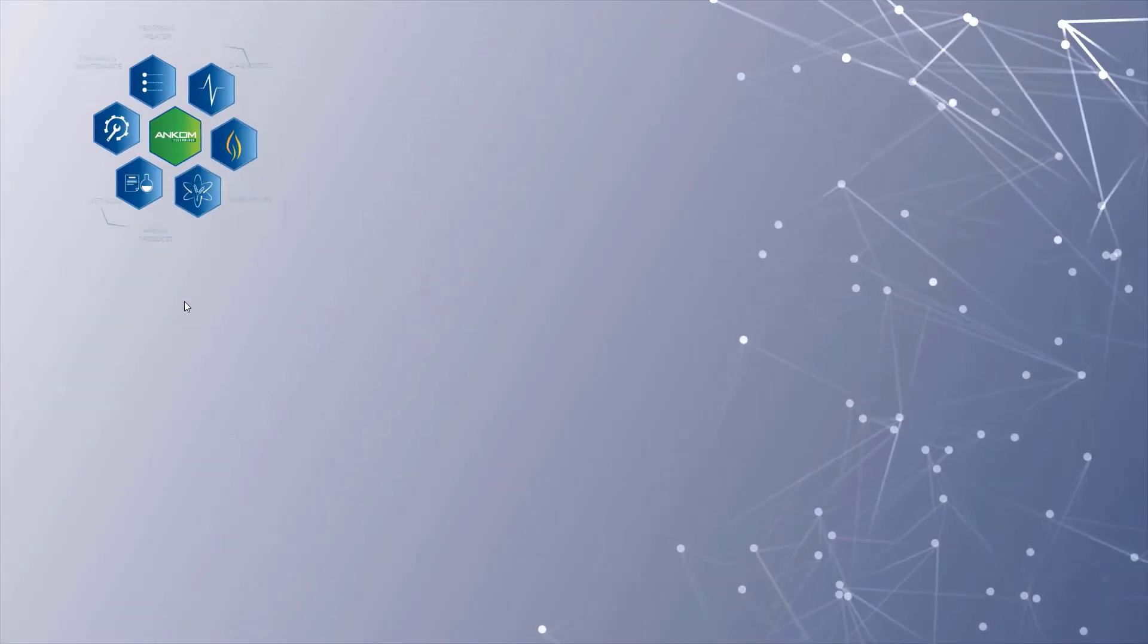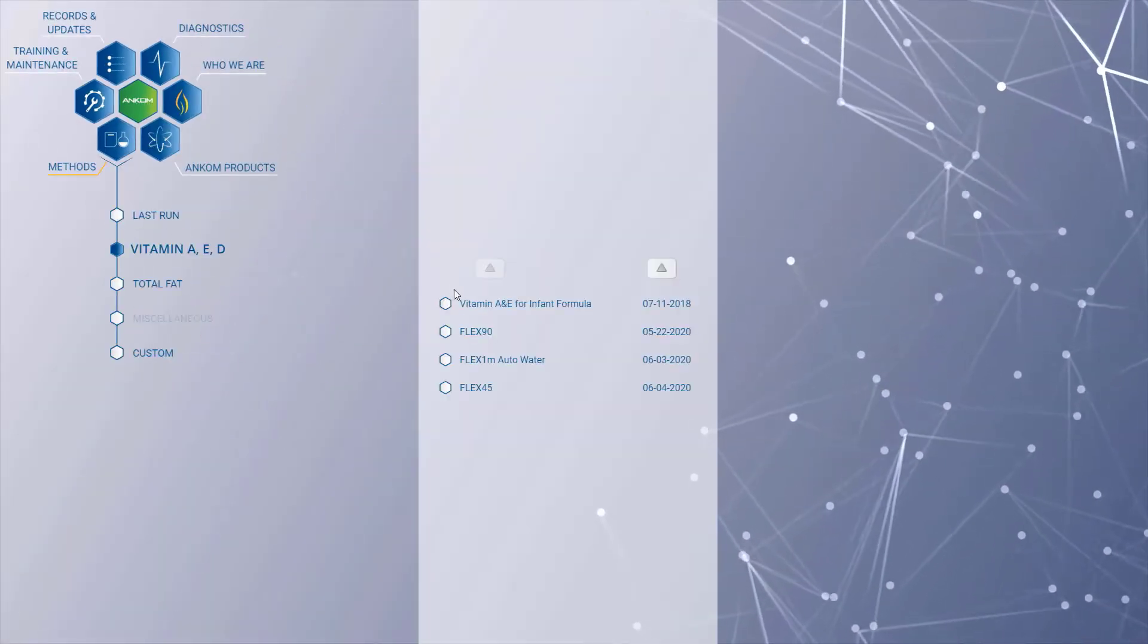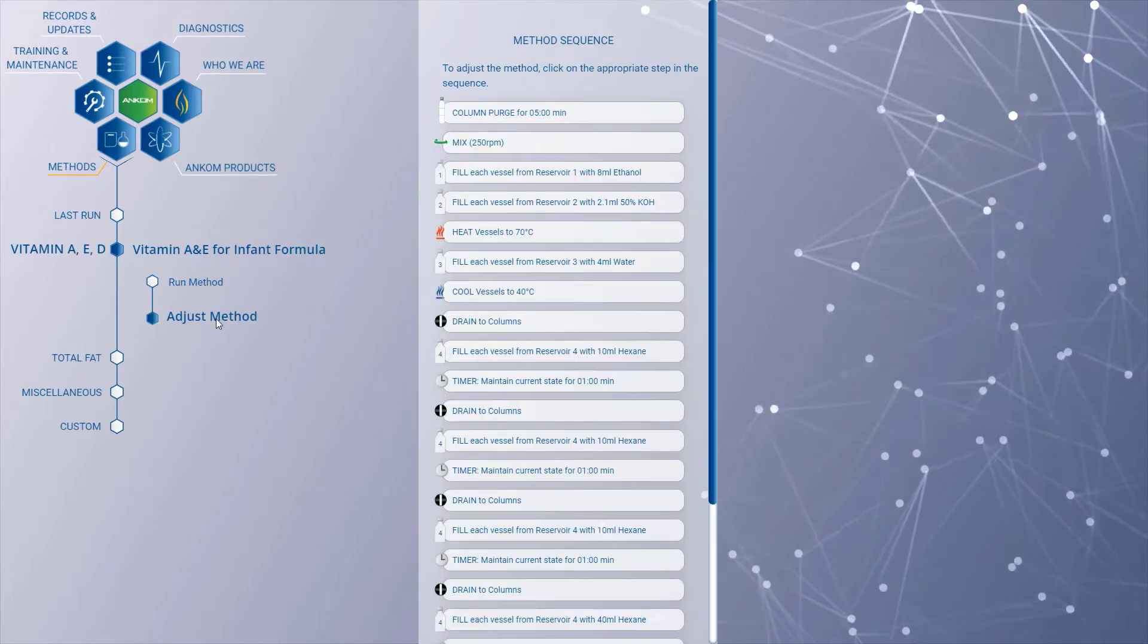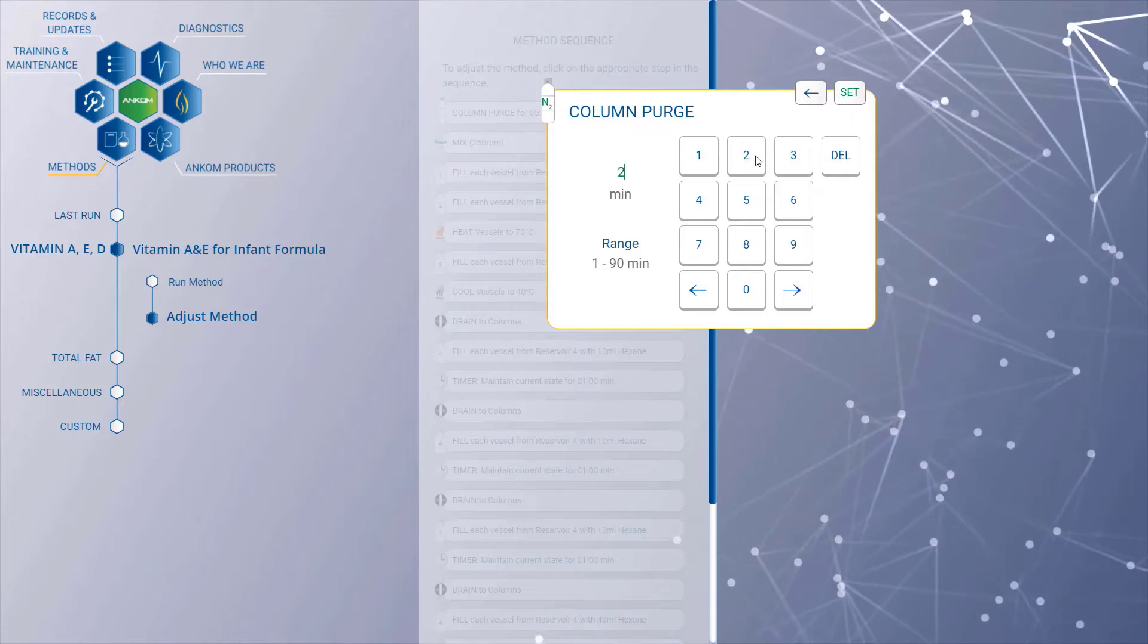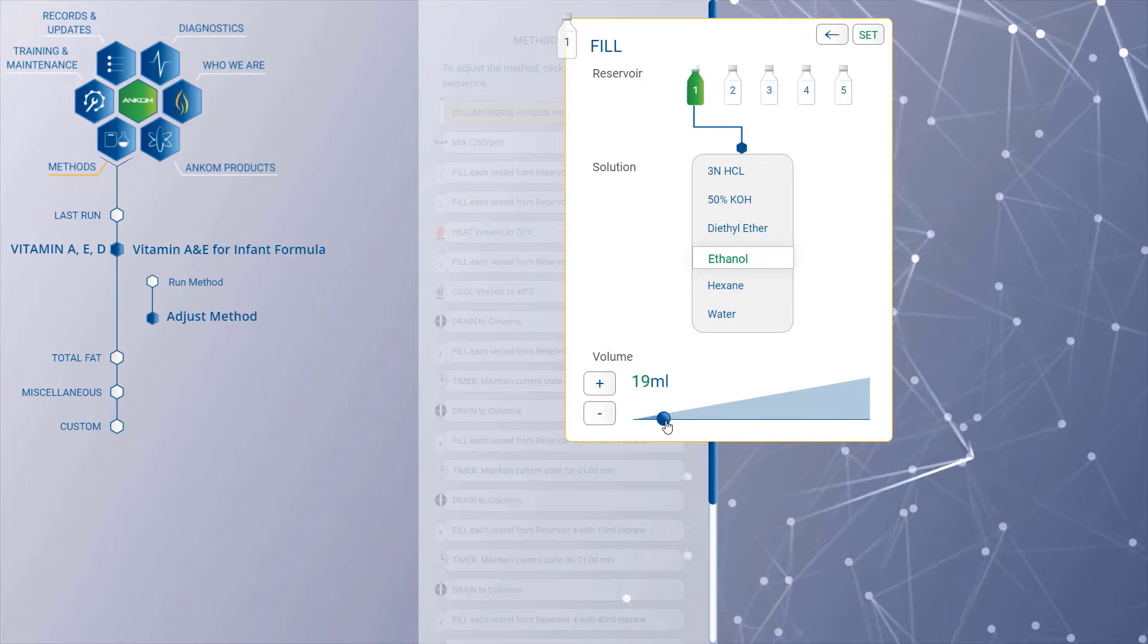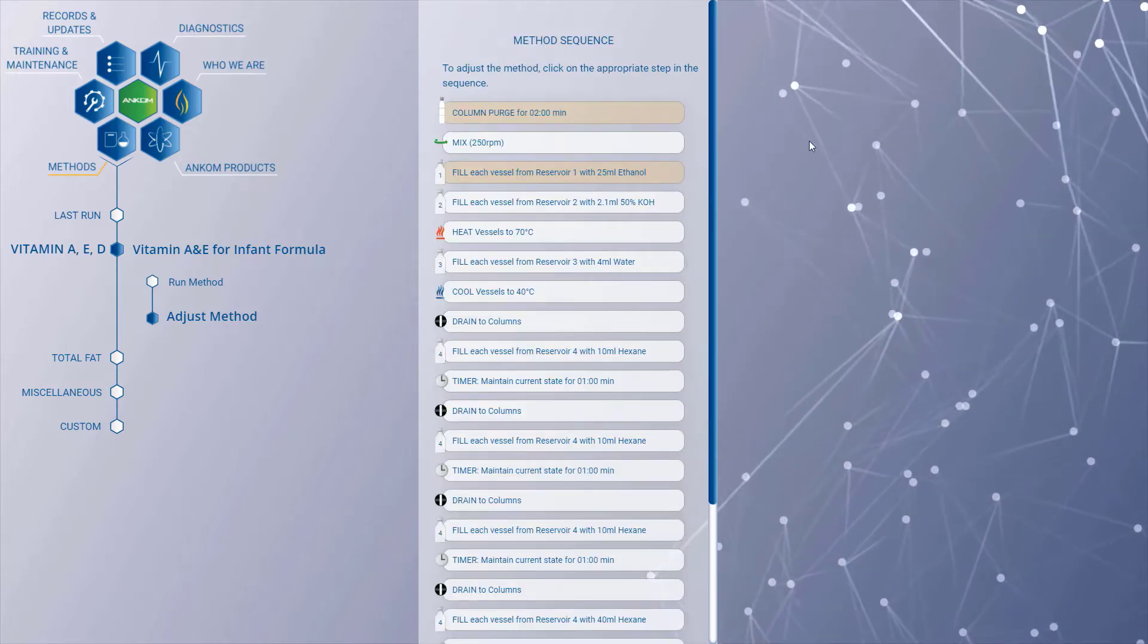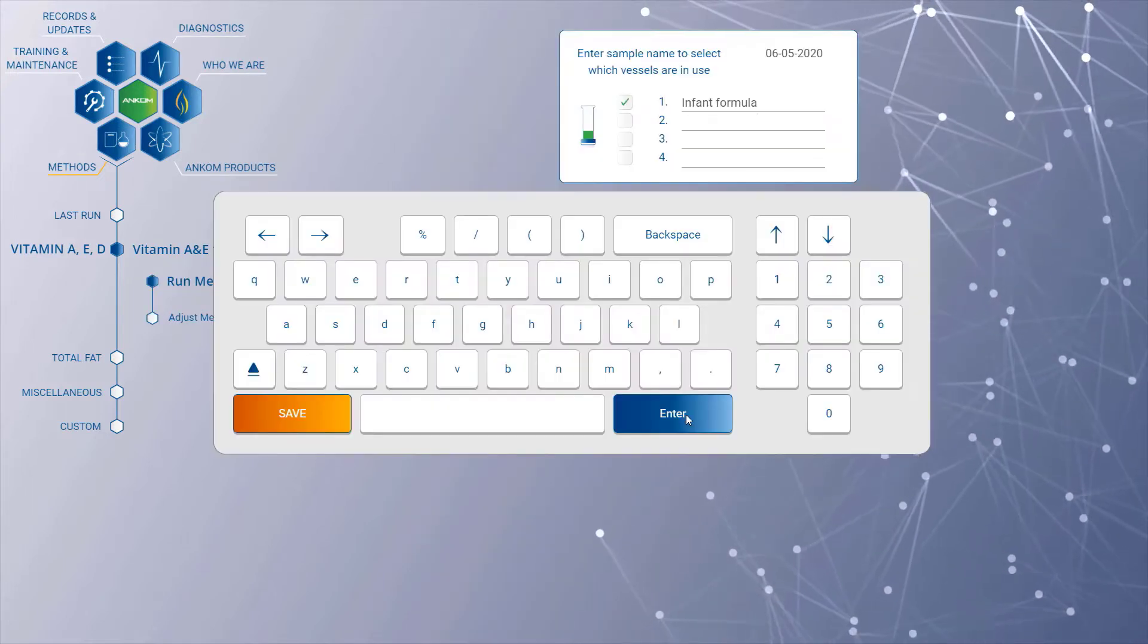The program allows the user to choose from standard pre-programmed methods or create and save their own methods on the touchscreen interface. Pre-programmed methods can be adjusted, or new methods can be created to meet the needs of many applications. The state-of-the-art software and interface provide the user with full control of the method design and process.